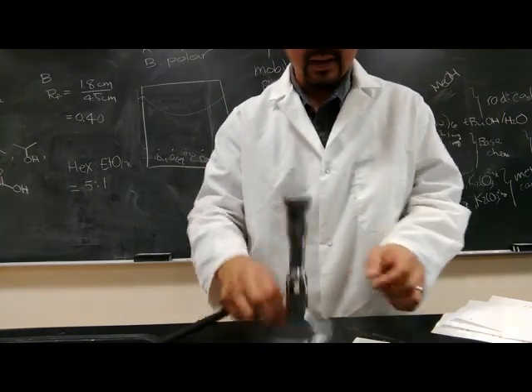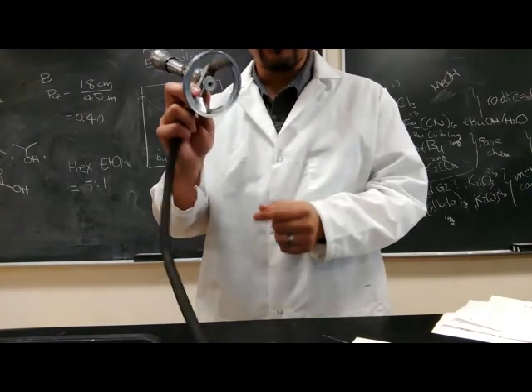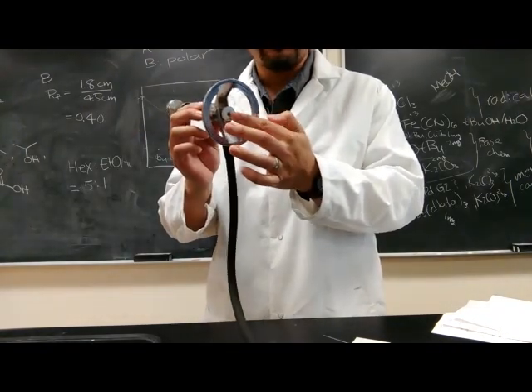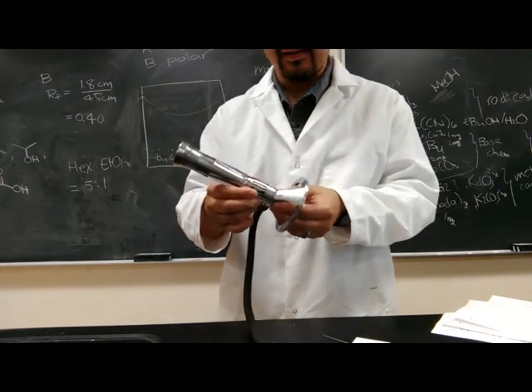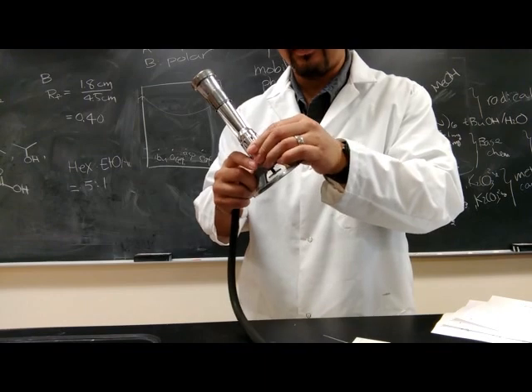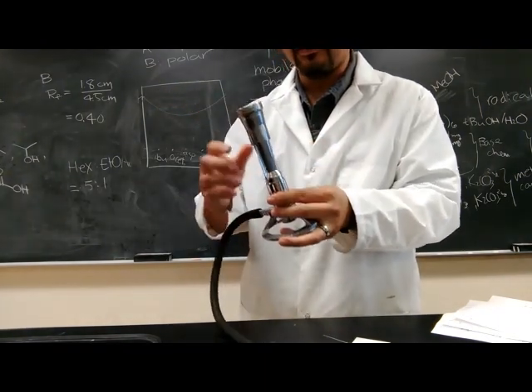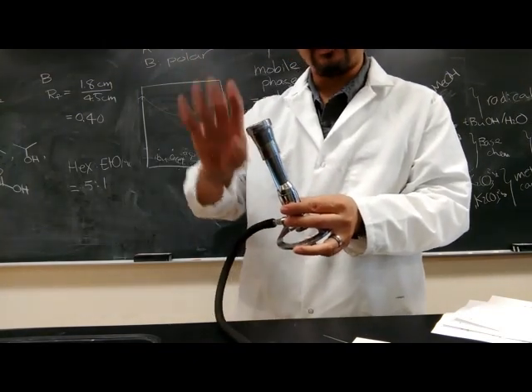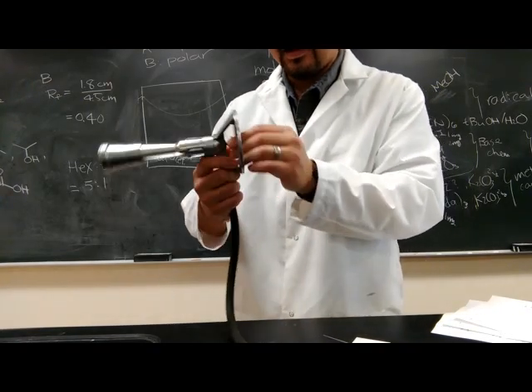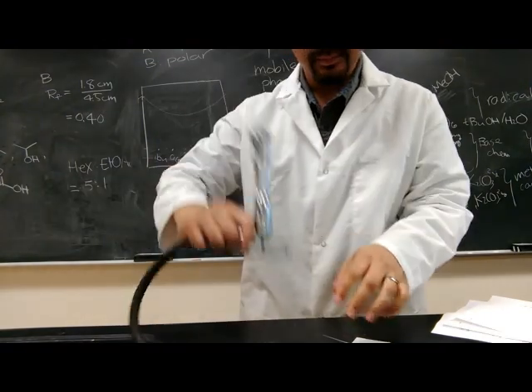But if you haven't, just to give you a brief rundown, there are two things you can adjust on a Bunsen burner: the airflow and the gas flow, because you need those two things to make a flame. When you light a Bunsen burner, you will want to have a low airflow, because if you have too much airflow, the gas comes up way too fast and it's really difficult to light it. And then you can adjust the gas flow with this dial at the bottom.